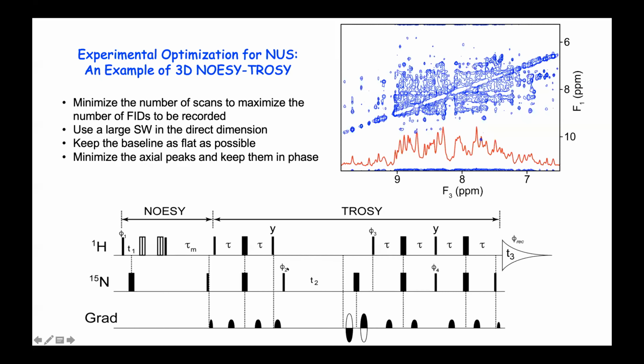So when I do 2-step phase cycling, I still prefer to do phi 2. Okay, so the water is clean. Then the problem is this. If you don't phase cycle phi 1, the problem is that there is something called the axial peak, which is a zero frequency peak, caused mostly by the T1 relaxation during the mixing time, and the pulse imperfection of phi 1, of course.